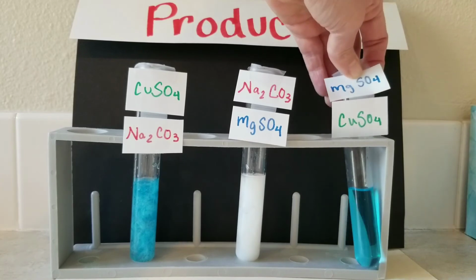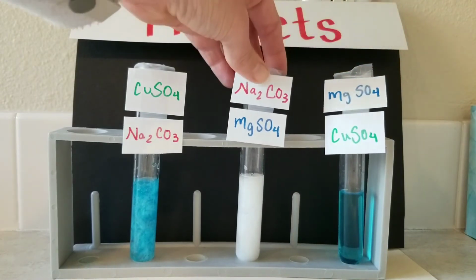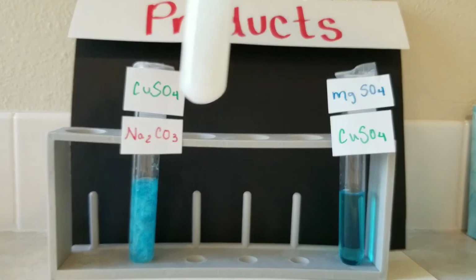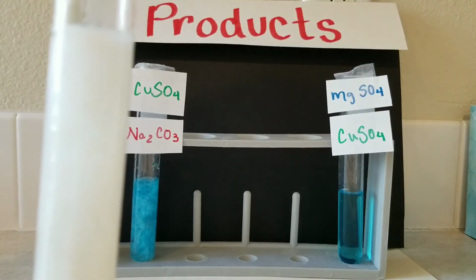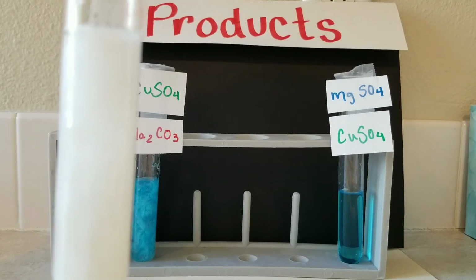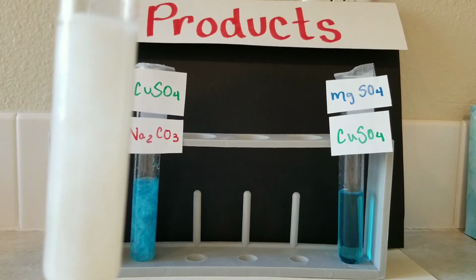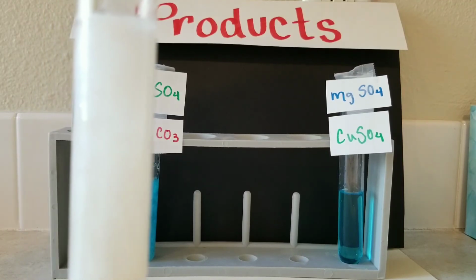Our middle one, where we had the sodium carbonate and the magnesium sulfate, we can see a little bit more close up here. The bubbles and goop, it looks like, that's inside floating around.